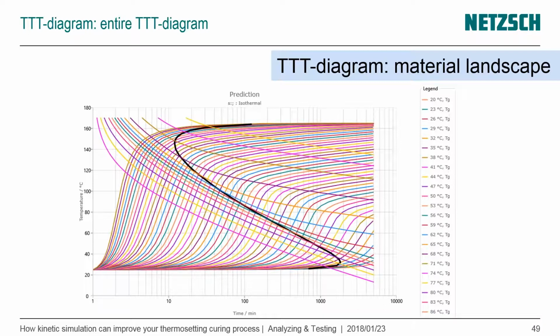And with this material landscape, you can set up your isothermal processes, because then you can follow the time temperature transitions of your material during isothermal cure.